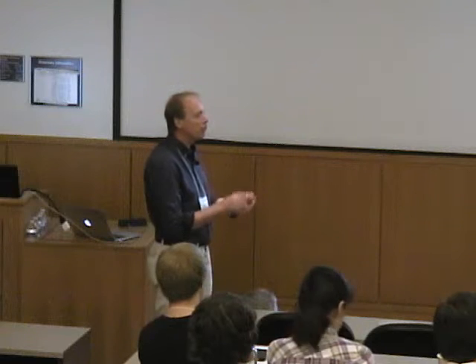situation, this population difference. And of course, these two processes then are going on simultaneously. And so it's important that we balance the amount of microwave power that we put in to match how fast the relaxation is so that we don't saturate the signal, don't wind up equalizing the population and losing our EPR signal, right? And so there are a couple of factors at play here. So the first one is the temperature, right? So if I go to very low temperature, the Boltzmann factor will become larger. The population difference will become larger.